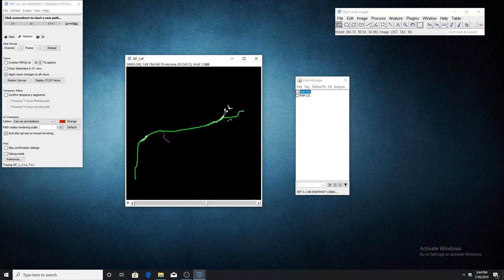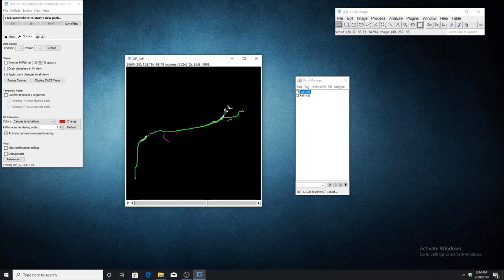You might have noticed that as I was tracing, I did not have to confirm the temporary segments. This is because I turned off the confirm temporary segments checkbox under the options tab.